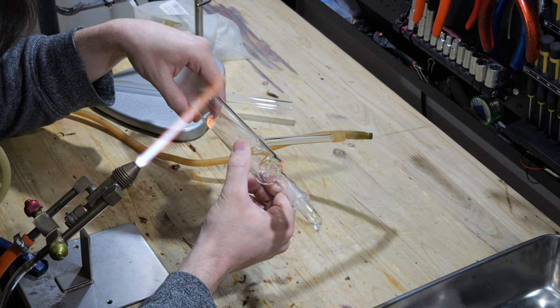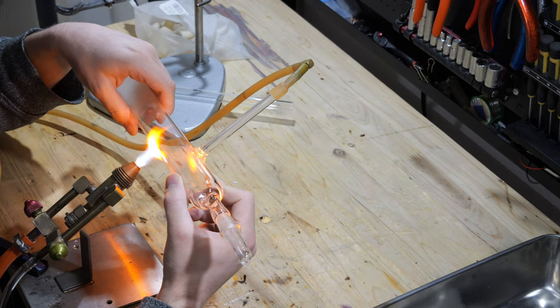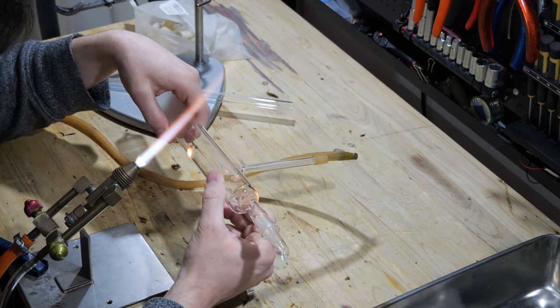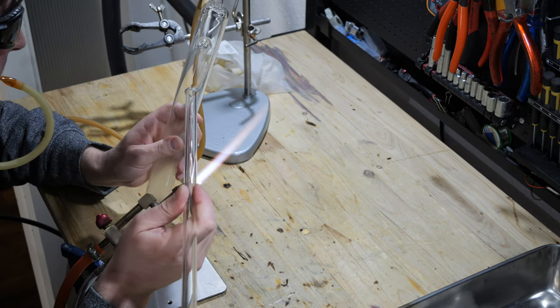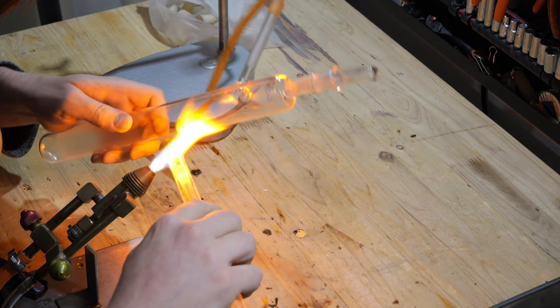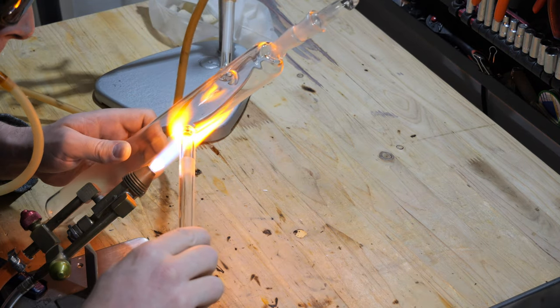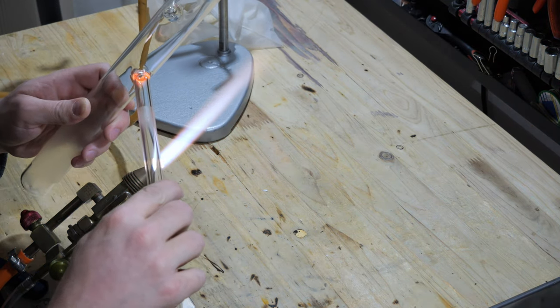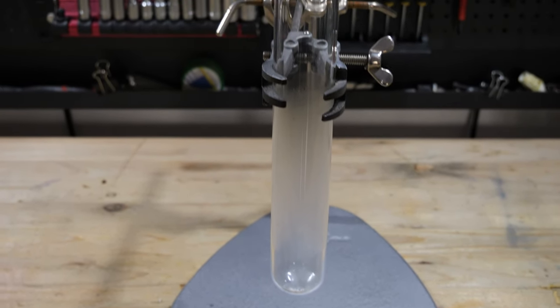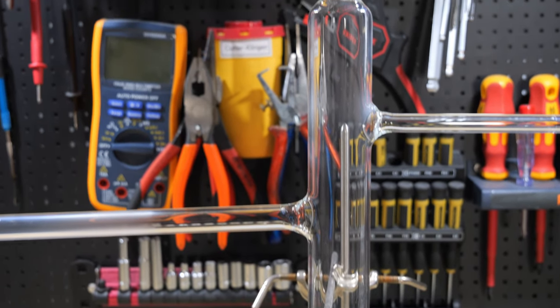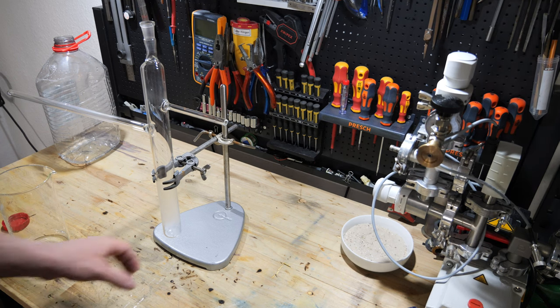The final step was to create another hole below the side neck for the vacuum pump and melt on a thicker, longer glass tube. This is the tube the potassium will flow into and which will be sealed off. Again, I would have liked to use a tube that had a smaller wall thickness, but I didn't have one on hand. But it will do for testing. And with that, the glass apparatus is ready.